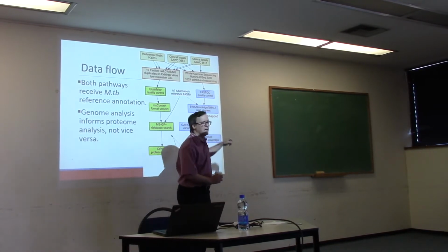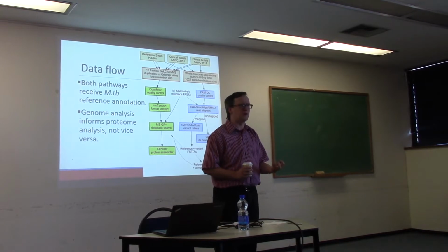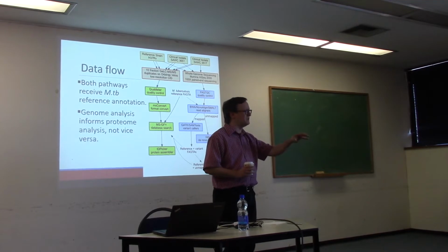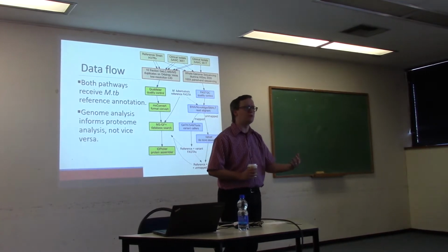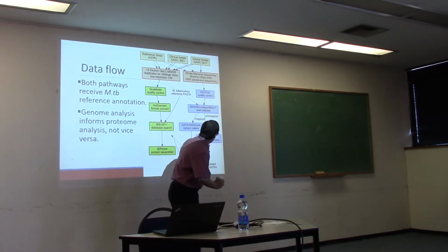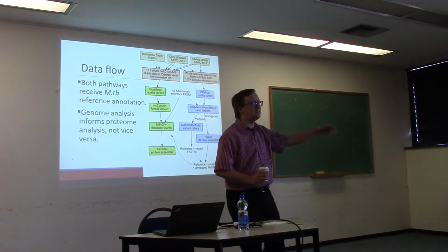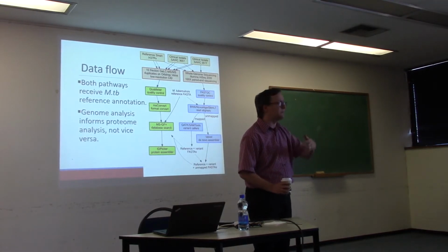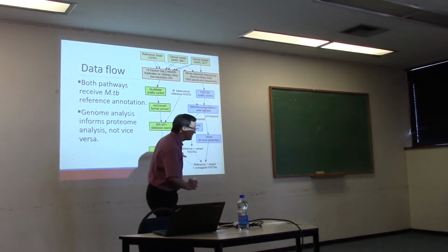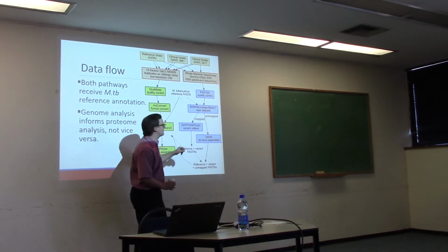And we had other bits of DNA read that didn't align to this reference genome. And that's kind of a problem of its own, isn't it? So here we've got this set of sequences that do not seemingly correspond to MTB. This stuff happens. So for that, we use something called a de novo assembler to try to create a contig that spanned all these reads that we had produced that didn't align to the reference genome. So that's a lot of work.